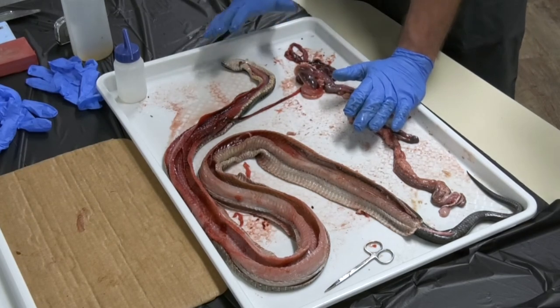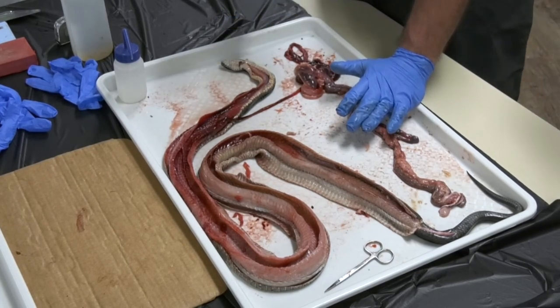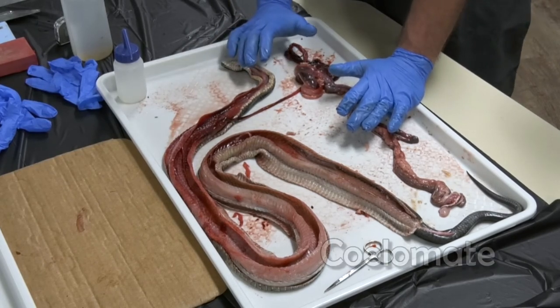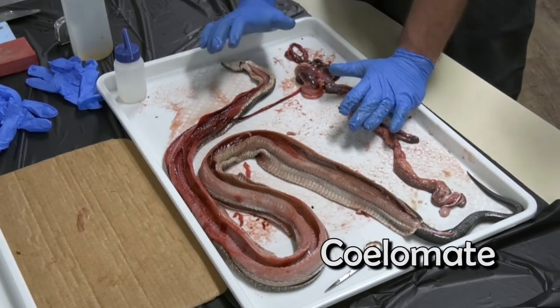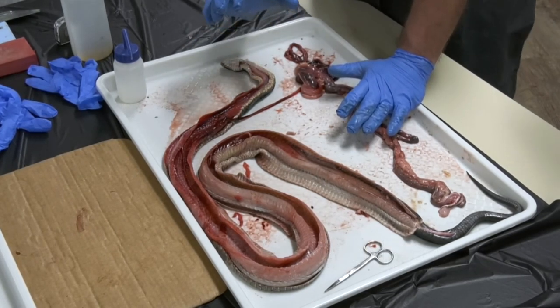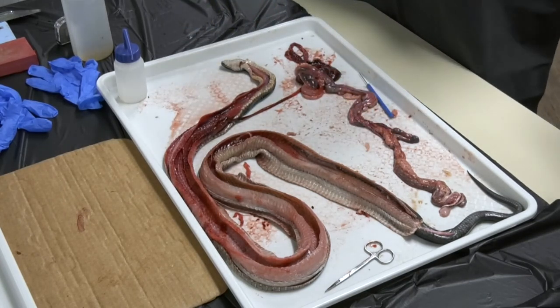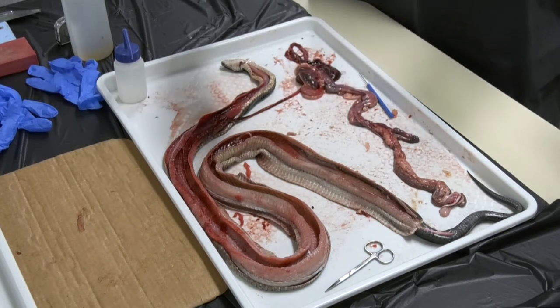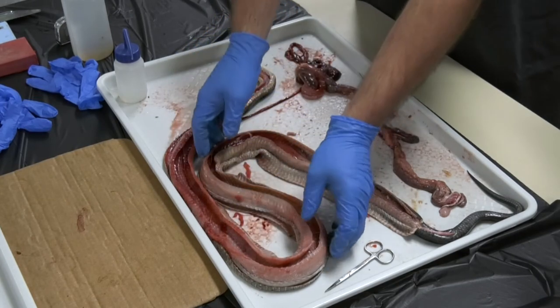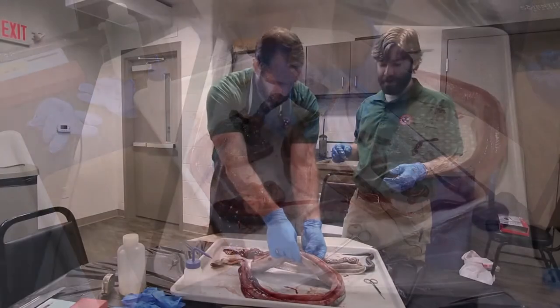Snakes, along with mammals, birds, fish, and most invertebrates of the world, even insects and lots of the other invertebrates, are in a group of animals that we call coelomates. And that's a weird word, coelomates with a C. What the coelom refers to is just a large central body cavity that houses most of the viscera. So we are coelomates. This snake here was a coelomate, and all of this viscera just peeled out and left behind what, Lance? Muscle and bone.